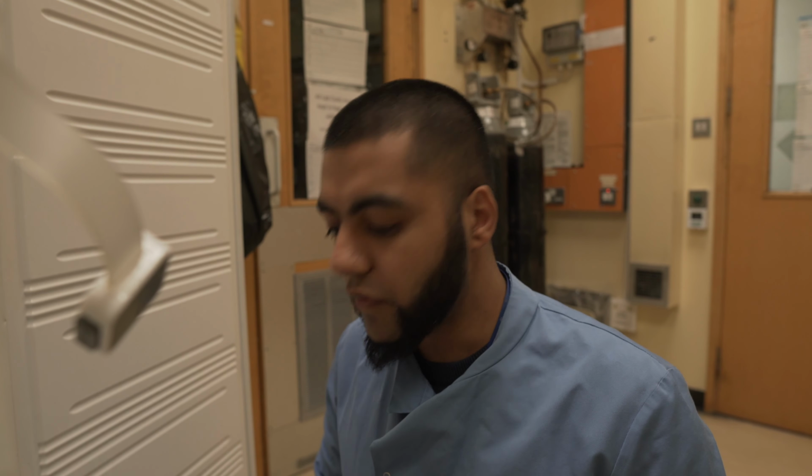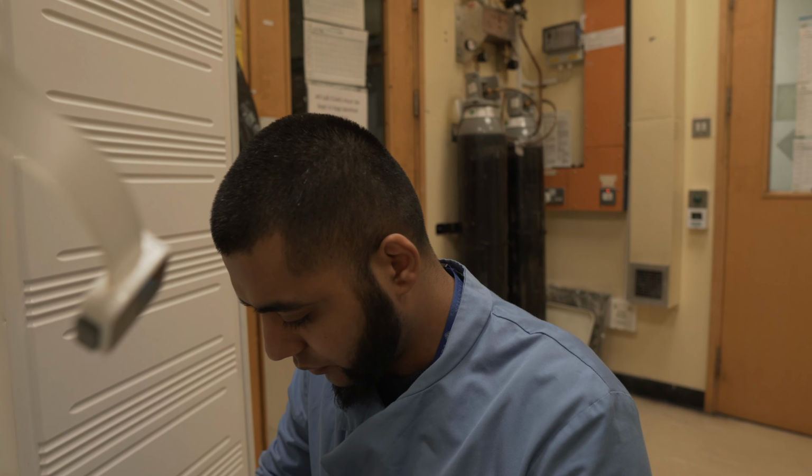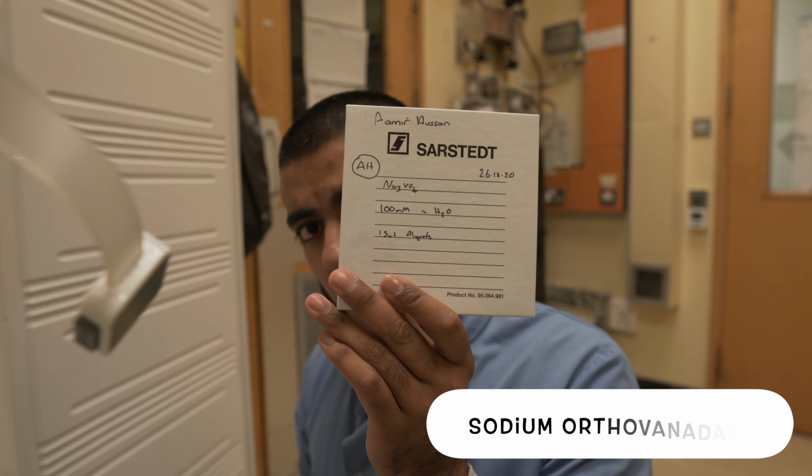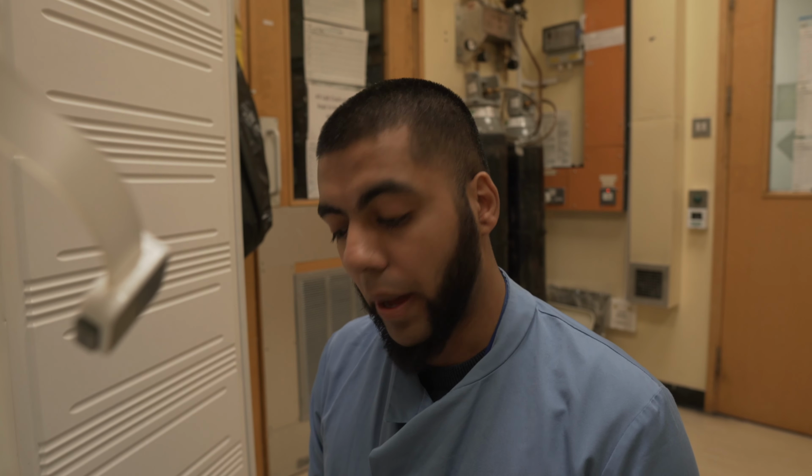Let's go to the first drawer, which is over here. Let's get cracking. Believe it or not, I think the best way is to show you on here what each item is and share some bit of information that might be a benefit for you. So, first one, this is a box here. This is something known as sodium orthovanadate, and if you do anything to do with proteins or extracting protein from cells, you might use that.